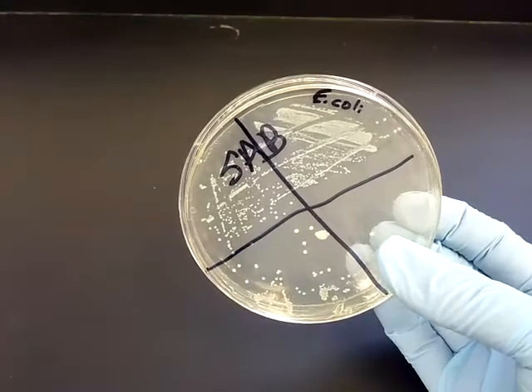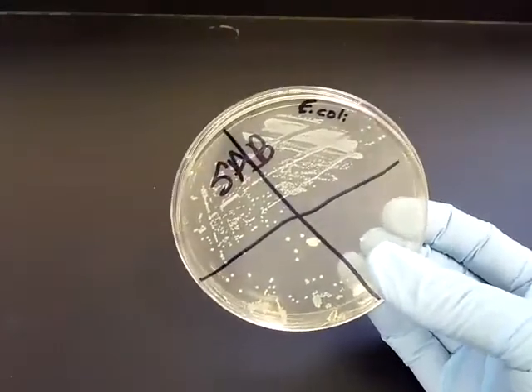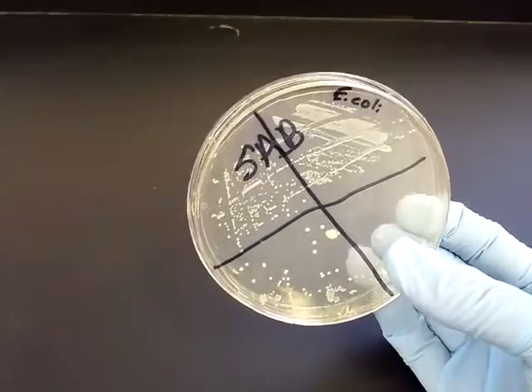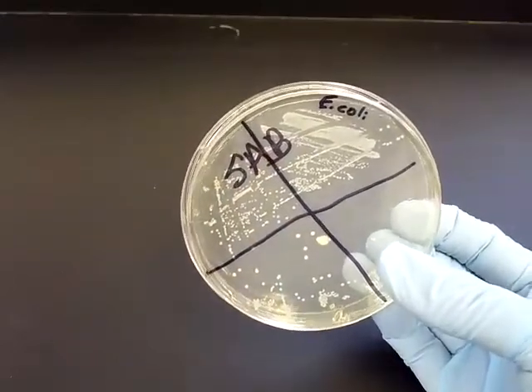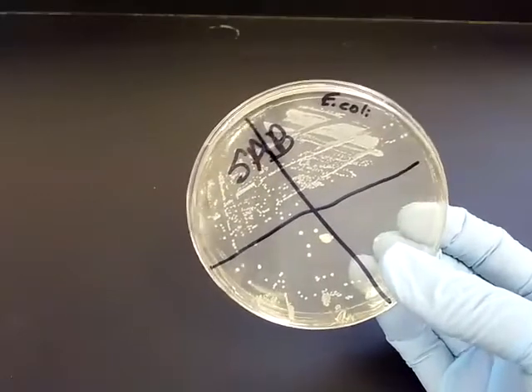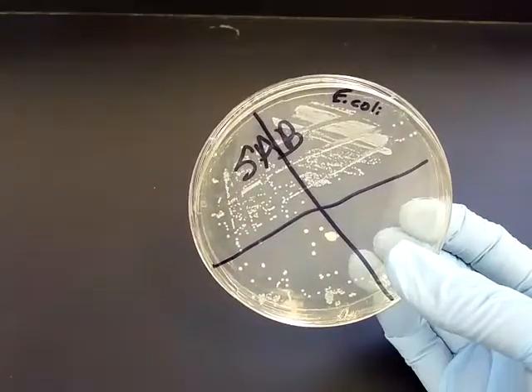So this plate was put in the incubator for a couple days, so about 48 hours we keep it in the incubator to grow. It grew at 37 degrees Celsius, which is 98.6 degrees Fahrenheit, or body temperature. This is E. coli growing on the plate, and you can see how there are now isolated colonies.